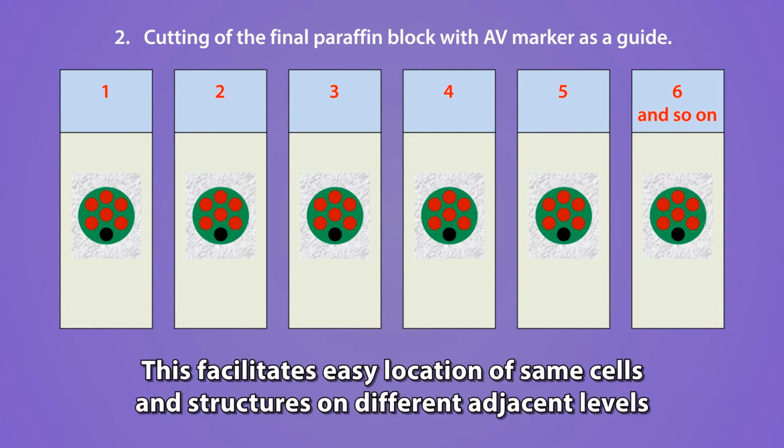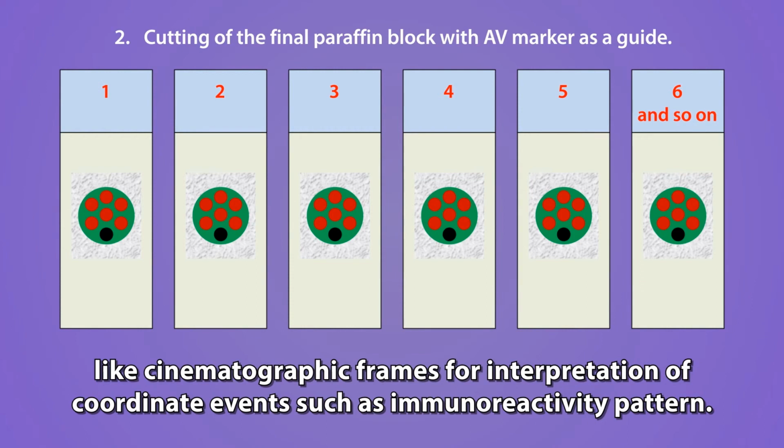This facilitates easy location of same cells and structures on different adjacent levels, like cinematographic frames, for interpretation of coordinate events, such as immunoreactivity pattern.